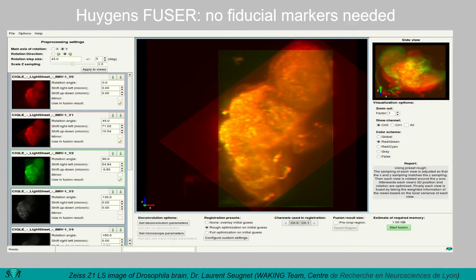Deconvolution can be performed on the input images before they are fused from this window as well. There are several options for specifying in which way the alignment should be fine-tuned and in which way the data from the input images should be combined to form the final fused image. A few preset combinations of these options are available in a single mouse click. The tool will give an estimate of how much memory will be needed. The automatic fine-tuning of orientation and position works both with and without fiducial markers, and the process will be aided by GPU acceleration.